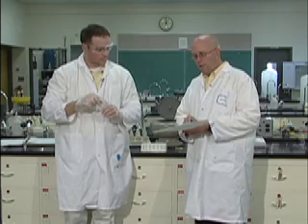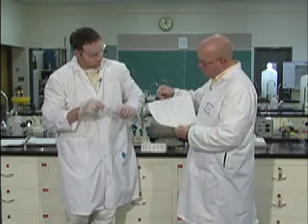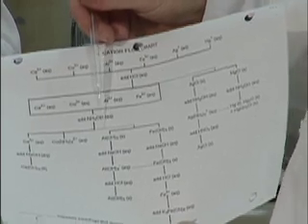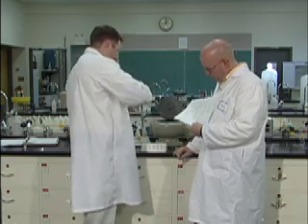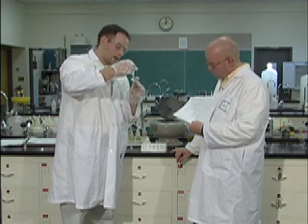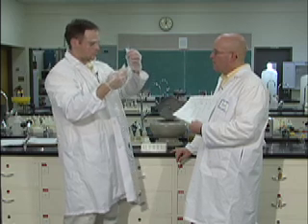Add ammonium hydroxide. The decant goes over here. No, the decant is on this side. The decant would be on this left side, and the precipitate's on the right side. So now we get to choose between aluminum ions or iron ions. Exactly. Now what we're going to do to this solid is add sodium hydroxide. What should happen is the aluminum cations should go back into solution, and the iron cations should remain solid.